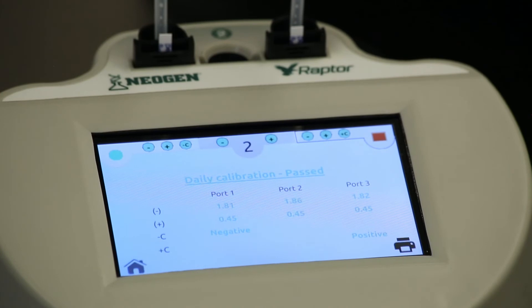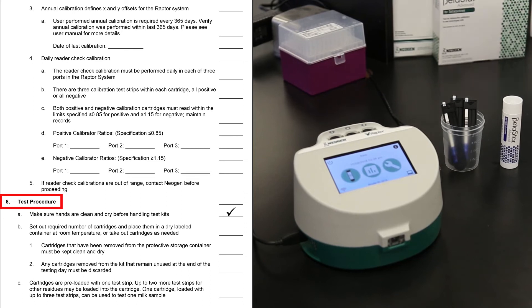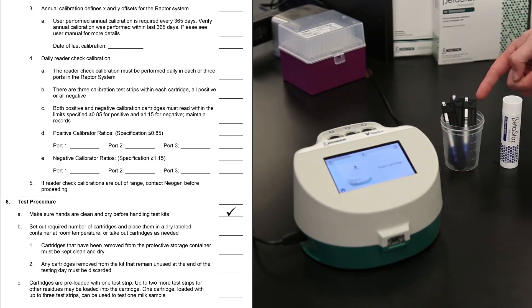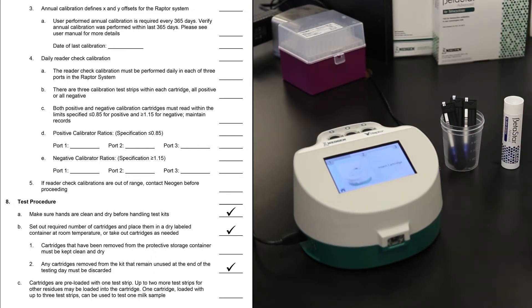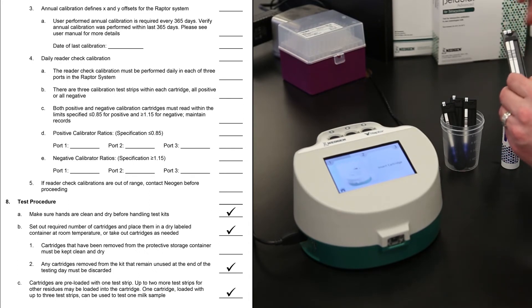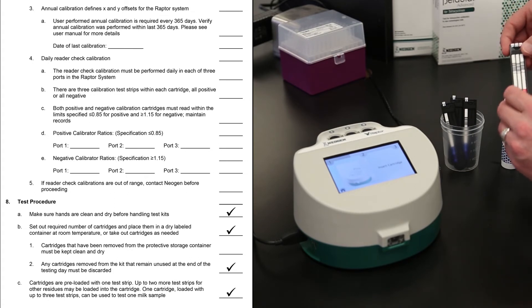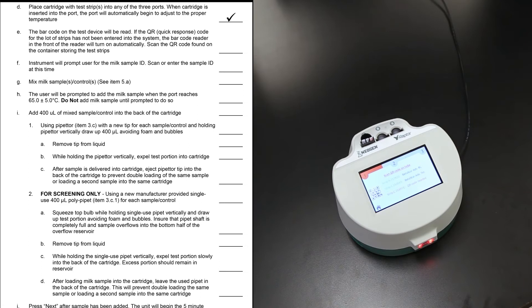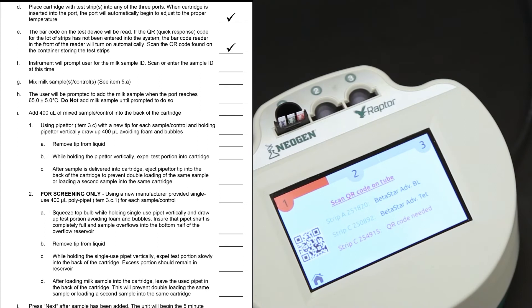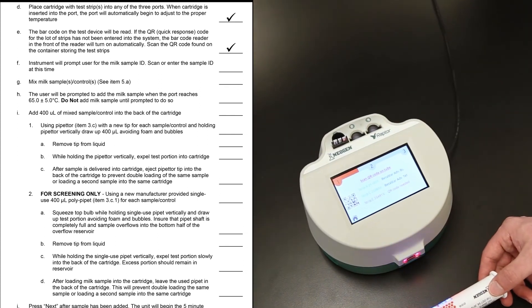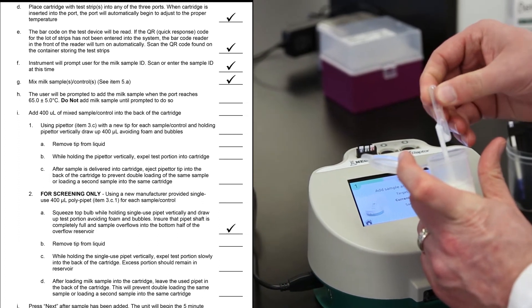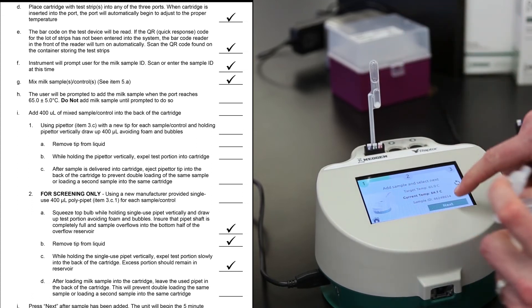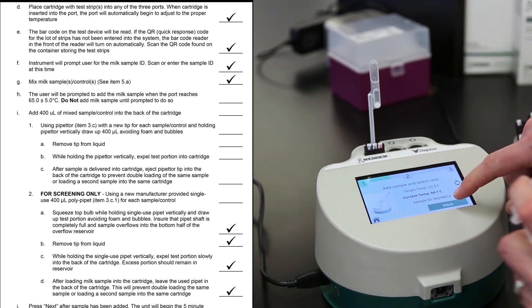Section 8 refers to the test procedure. Make sure to set out the number of test strips and cartridges to be used for the day. Unused test strips must be discarded at the end of the testing day. A beta-lactam test strip is added to the Raptor cartridge, and up to two more test strips for other antibiotics or residues may also be added. Place the cartridge into any of the three ports. The lot ID barcodes on the test strips are automatically scanned. If the QR code for the lot of strips has not been entered into the system, the barcode reader automatically turns on — scan the QR code found on the container. Either enter a sample ID with the on-screen keyboard or scan a sample ID with the built-in barcode scanner. Add 400 microliters of milk to the back of the cartridge, then leave the tip in the back of the cartridge as a visual cue that you've already added the sample.